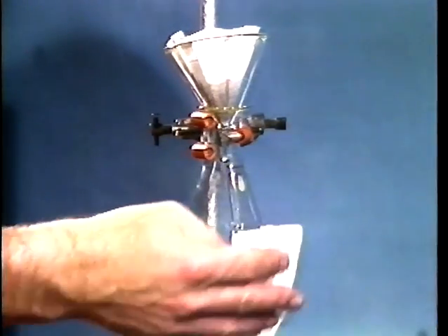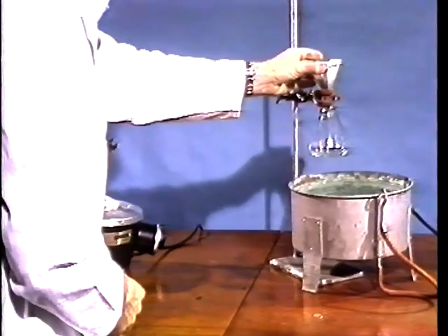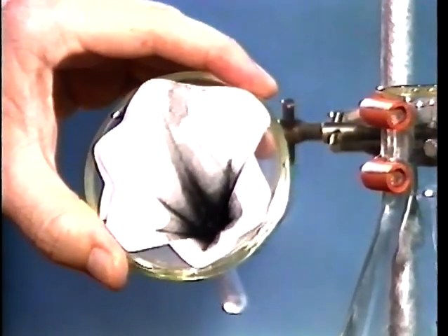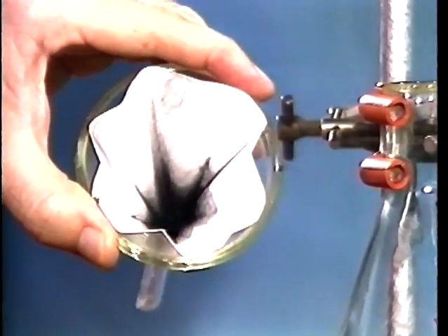The soluble material should then have gone into the Erlenmeyer, and the insoluble impurity remains on the filter paper. Allow the solution to cool and induce crystallization as before.